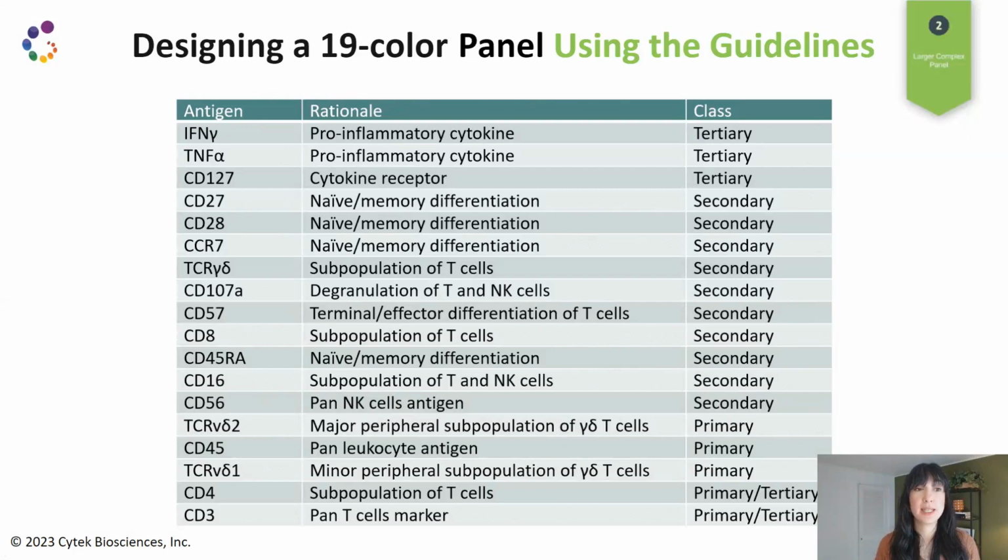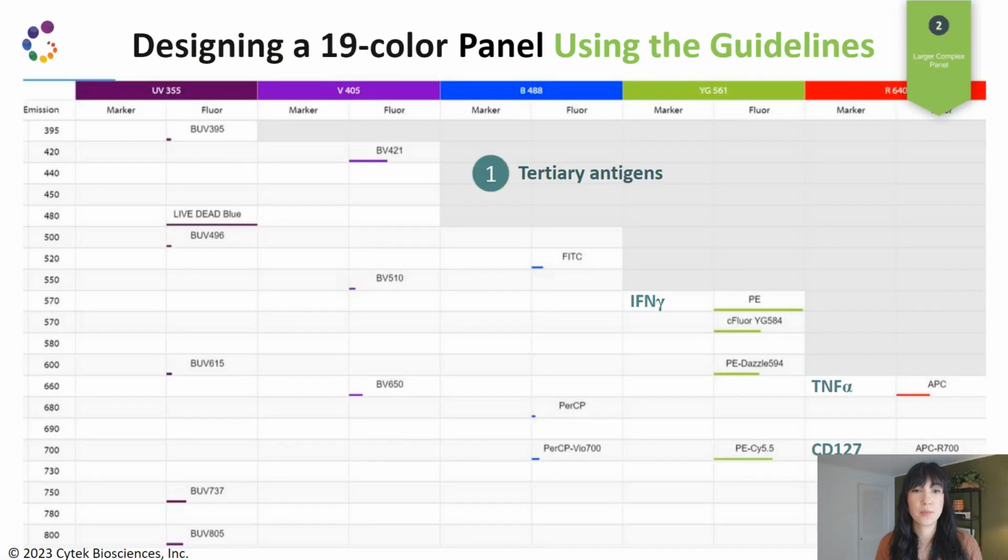And this is because we're using a stimulation condition. So in the stimulated condition, we have markers that are going to be internalized, so they become tertiary as they get stimulated. So we need to pay attention to that in our panel design.